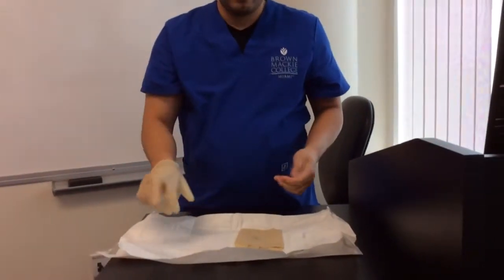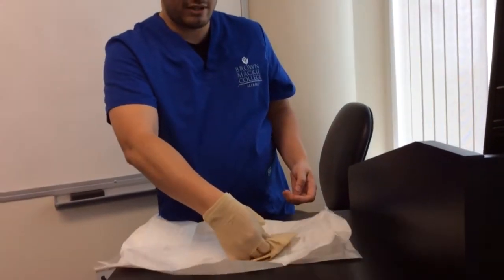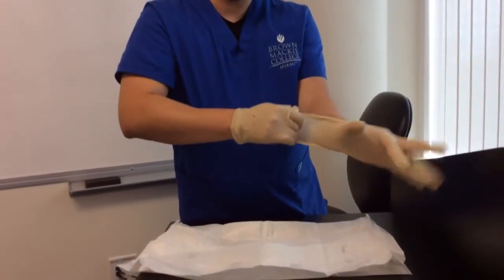After that, you're going to put your hand inside the cuffing inside of the gloves so that you won't lose any of the sterilization of the glove. And place your other hand inside without the gloves touching any of your skin.